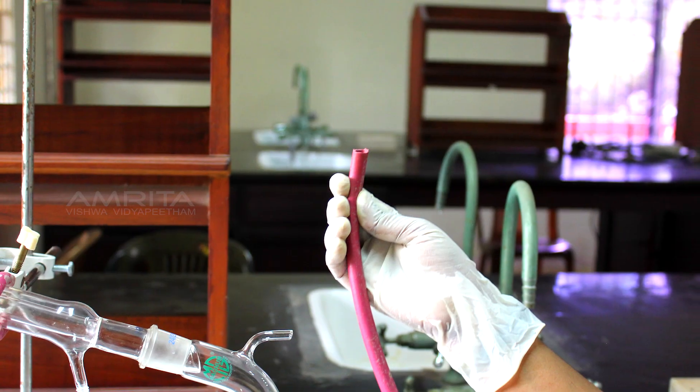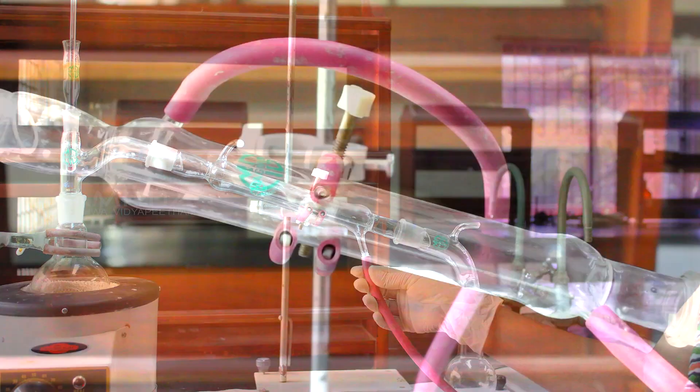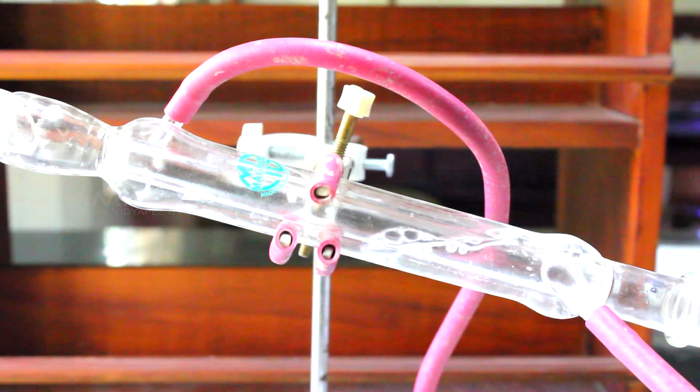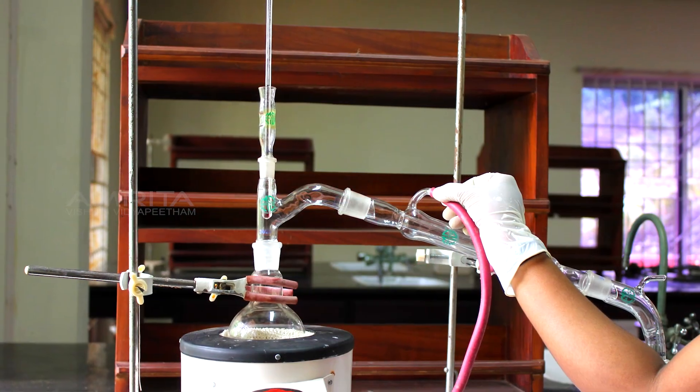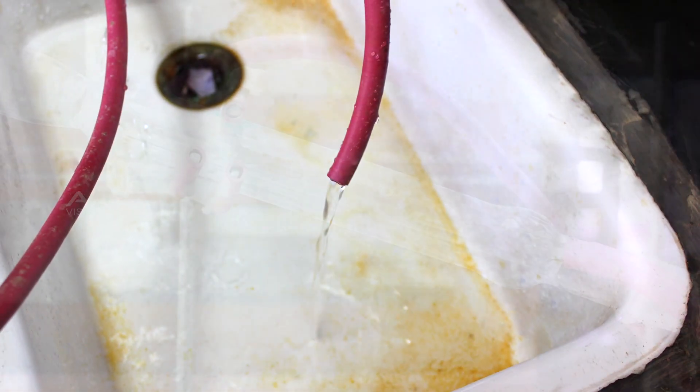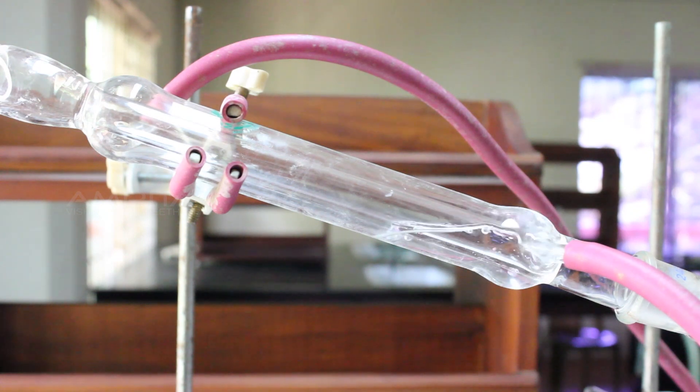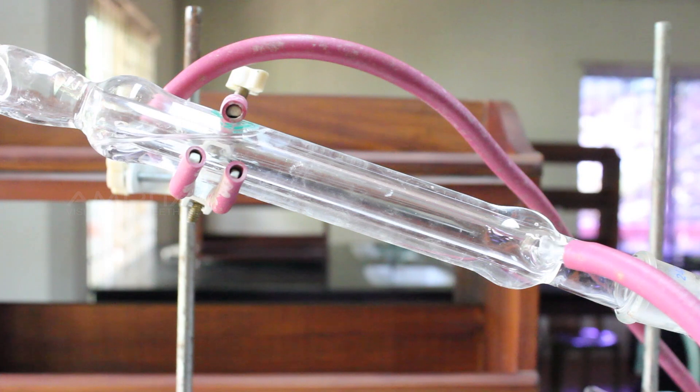Then, connect a rubber tube between the tap and the inlet of the condenser to allow cold water to enter. Similarly, connect another rubber tube to the outlet of the condenser to pour the hot water from the condenser to the sink. Open the tap so that water flows through the tube and fills the condenser and then comes out through the outlet.